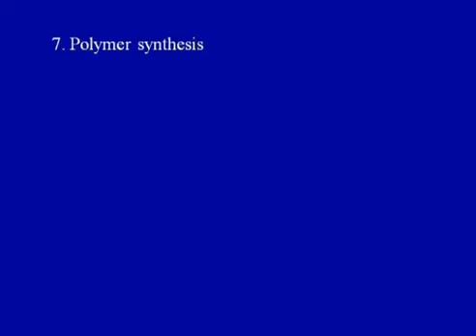Many times in polymer synthesis it could be utilized to measure the size and the polydispersity of a synthesized polymer. That is the ability to find the distribution of the size of the polymer molecules, and if standards of a known size are run previously, then a calibration curve can be created to determine the size of polymer molecules of interest in the solvent. So, these are different applications of the gel filtration chromatography technique. As you see, it is a very useful technique and has many applications.